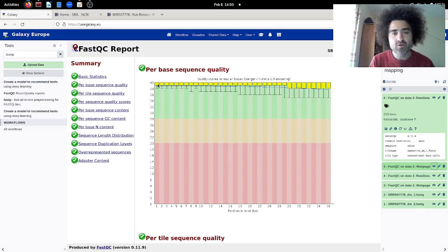So if I take all the reads and exactly the position 1 and I write down the qualities, then I will have all the values here that are represented with this box plot. And probably it informs me here that the lowest quality is 38 and the highest quality is 40, and median probably is 40, and so on and so forth.